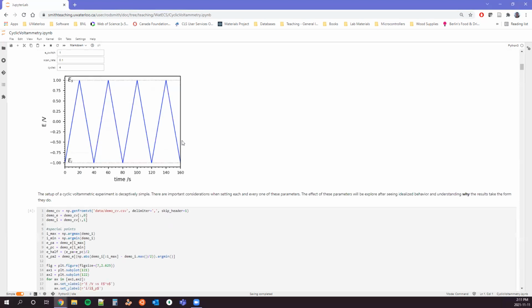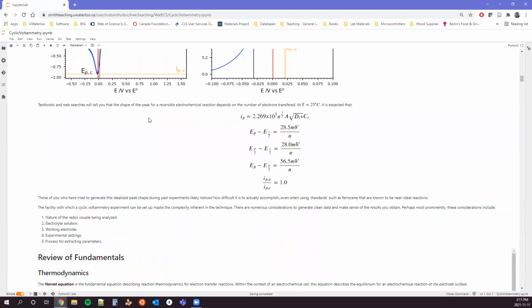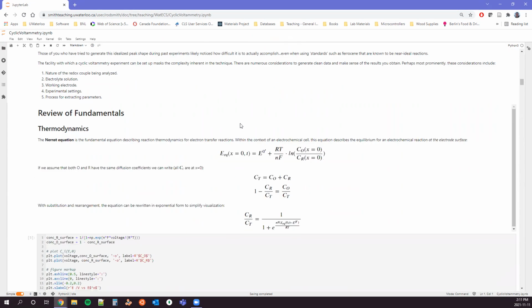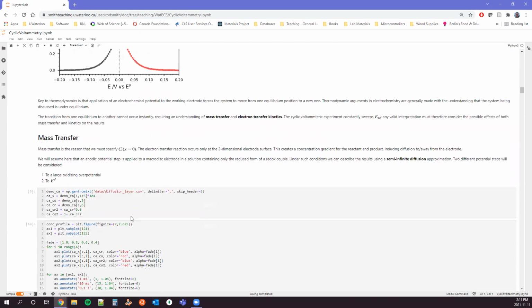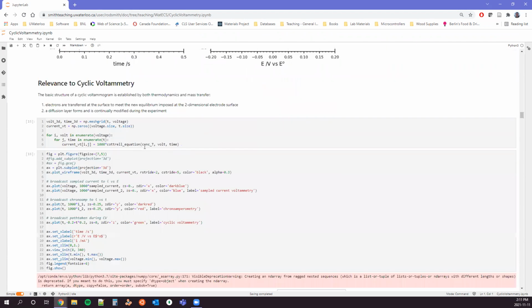And they're asking the reasoning for that value and if that's always going to be the case for an ideal reversible system, or where that comes from. Yeah, so it's supposed to be. This is what people often look for when they're doing electrochemistry. These are the values that come out in an ideal situation. As we saw here, there's my curve that I'm looking for.